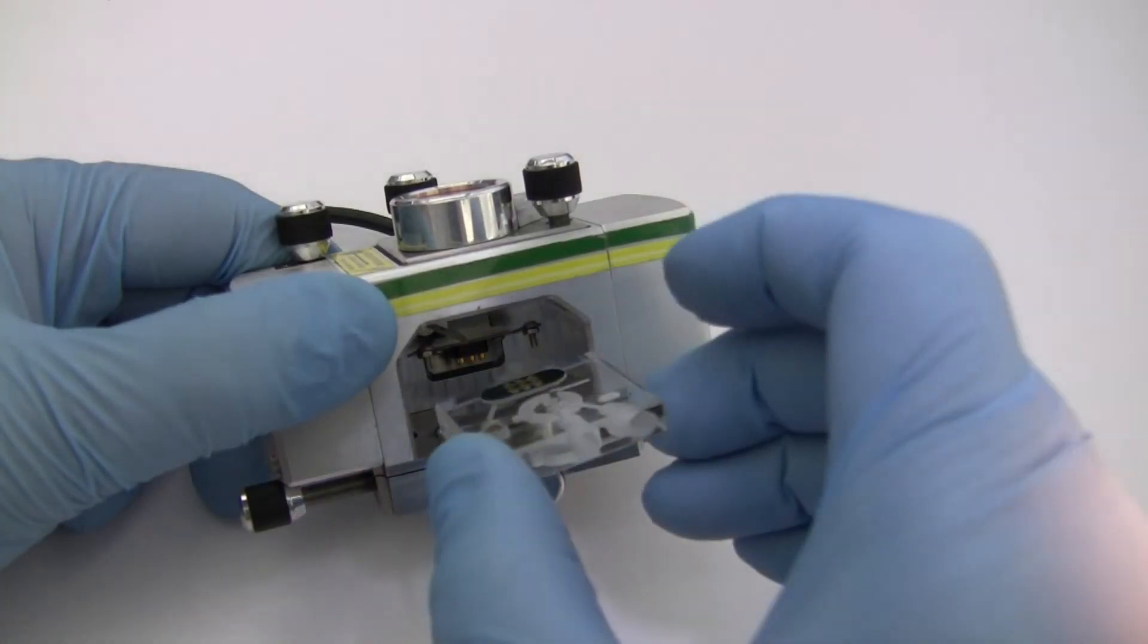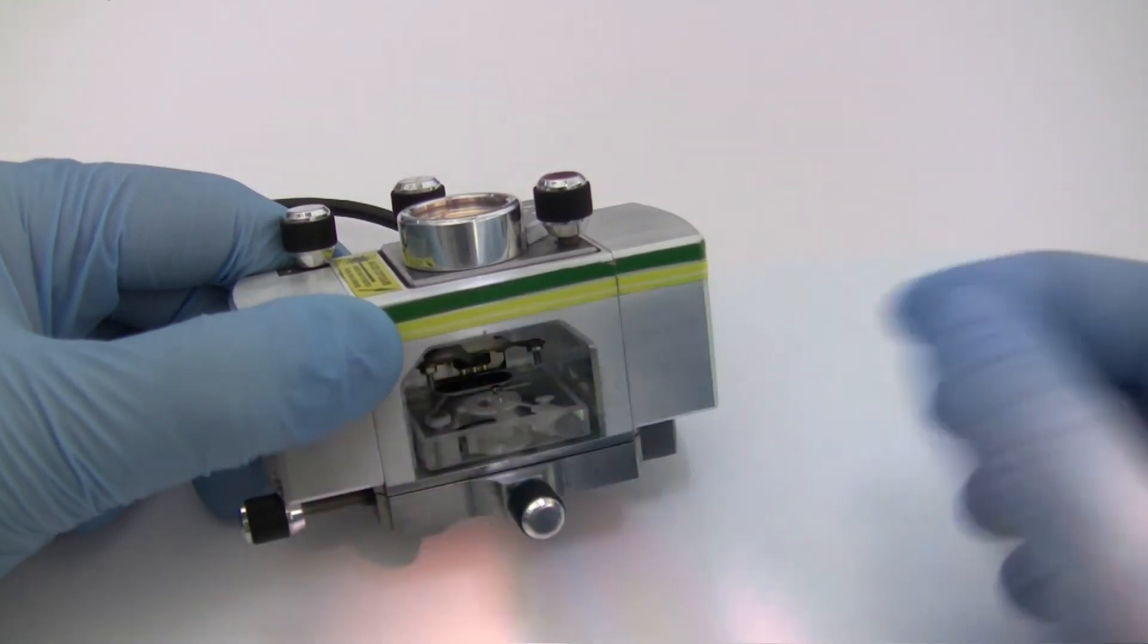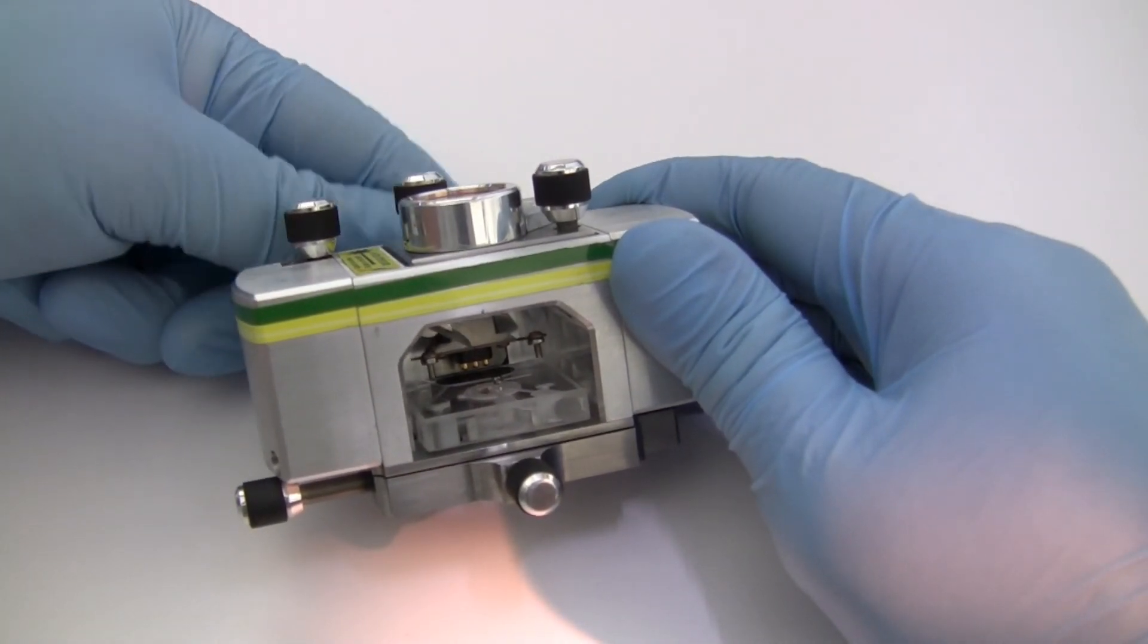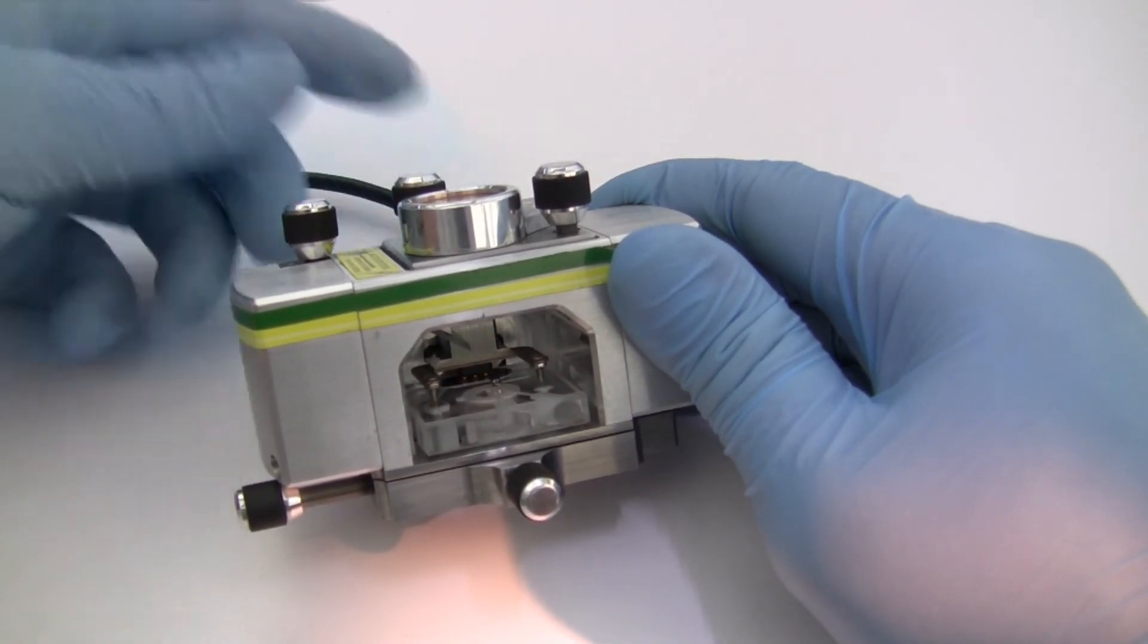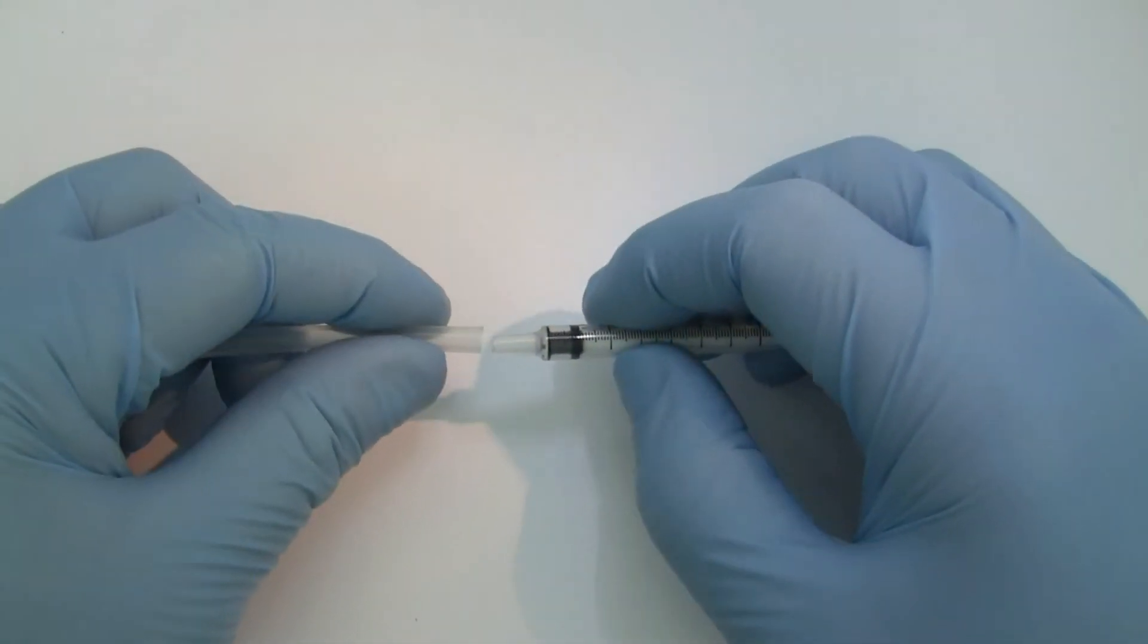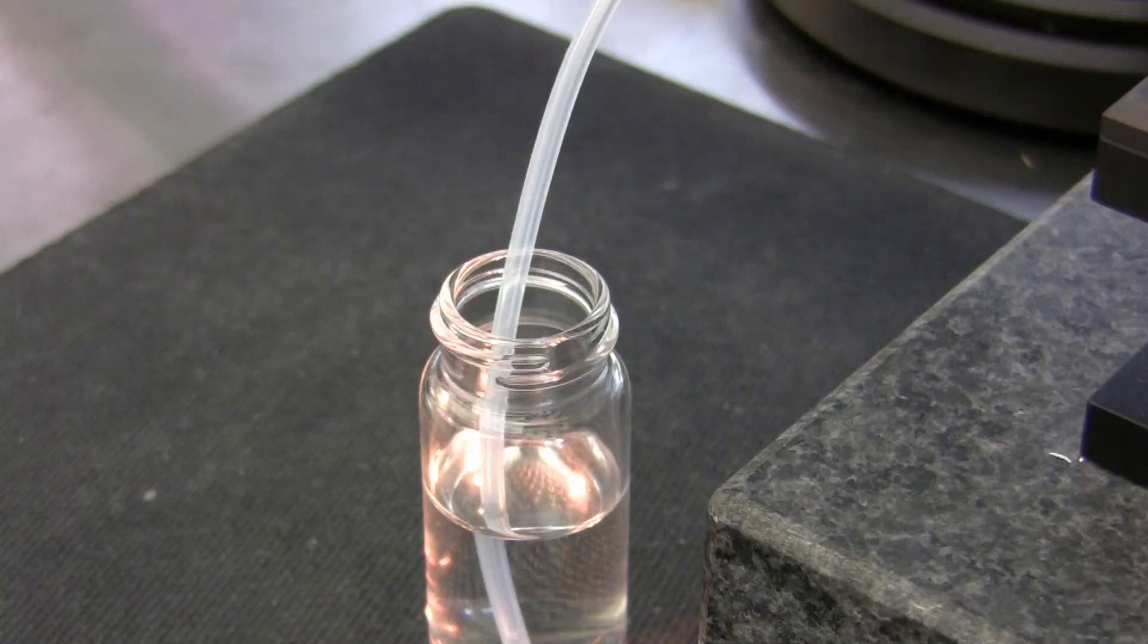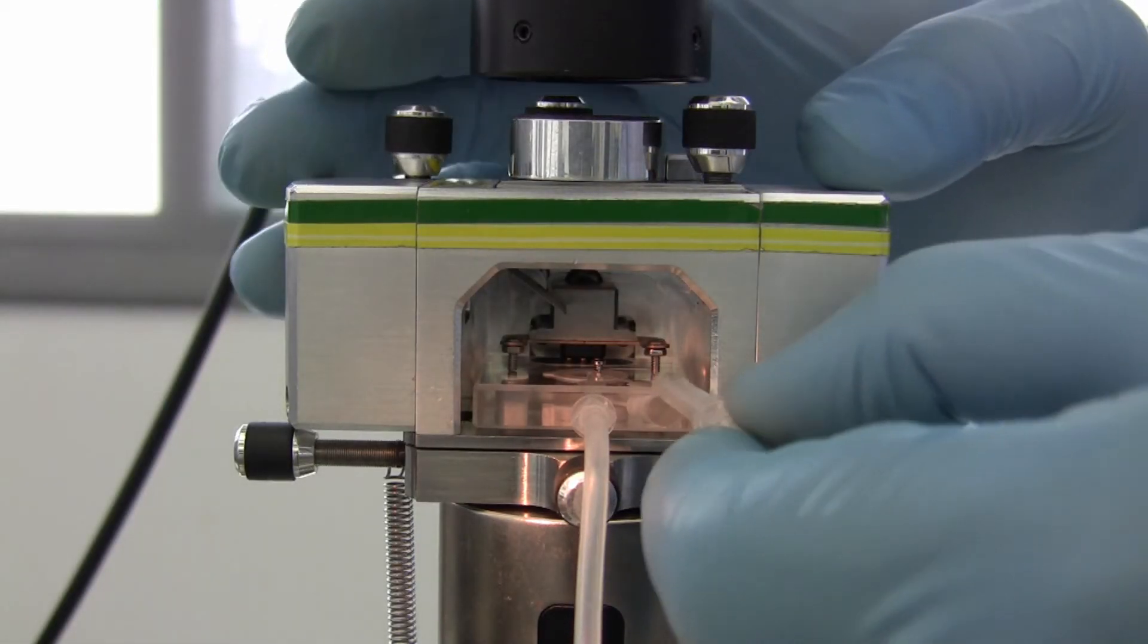Place the probe carrier into the multimode head by inserting the carrier into the kinematic mount and then turning the clamping screw to lower the locking clamp onto the probe carrier. Insert a lure fitting into the drain port. Attach the syringe to the inlet section of tubing and fill it with the liquid solution. Insert the lure fitting into the inlet port.